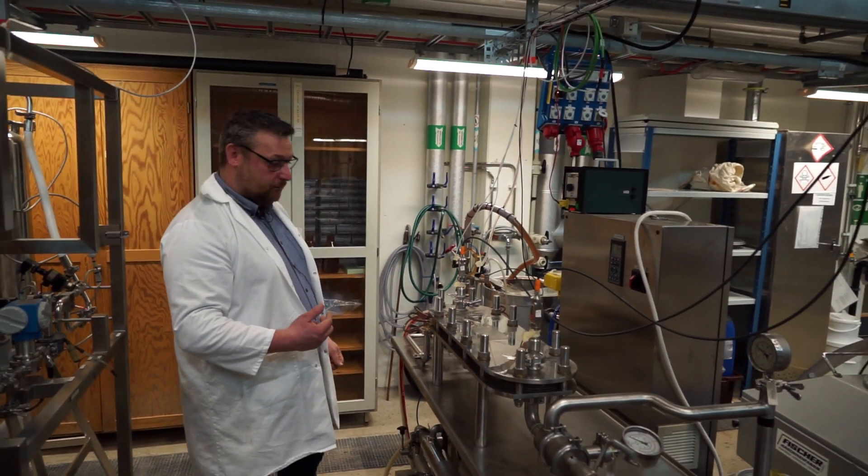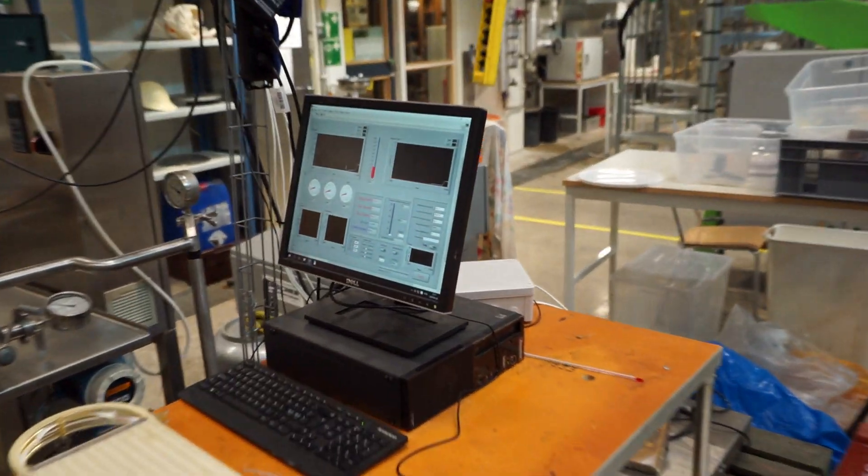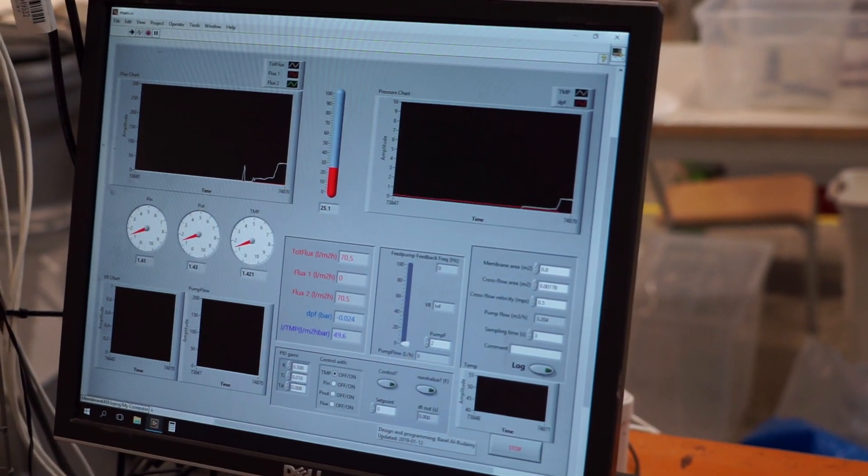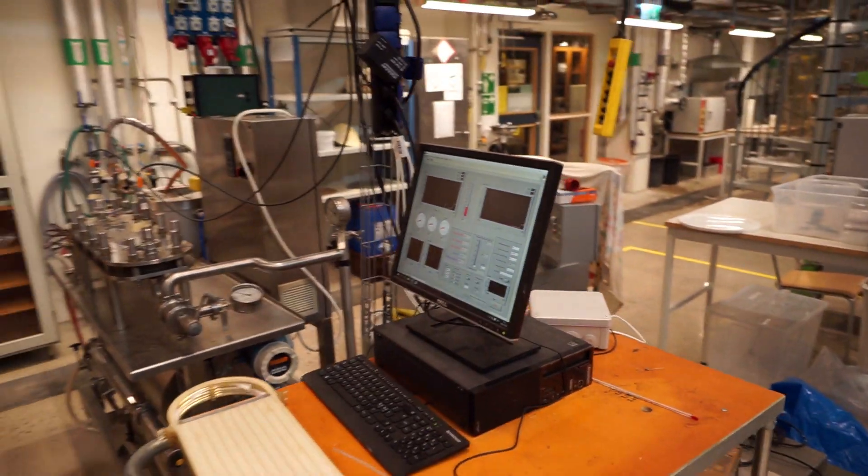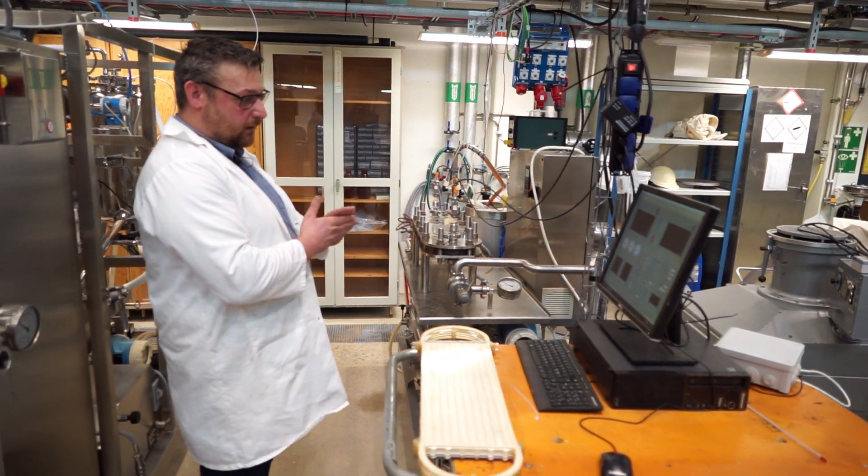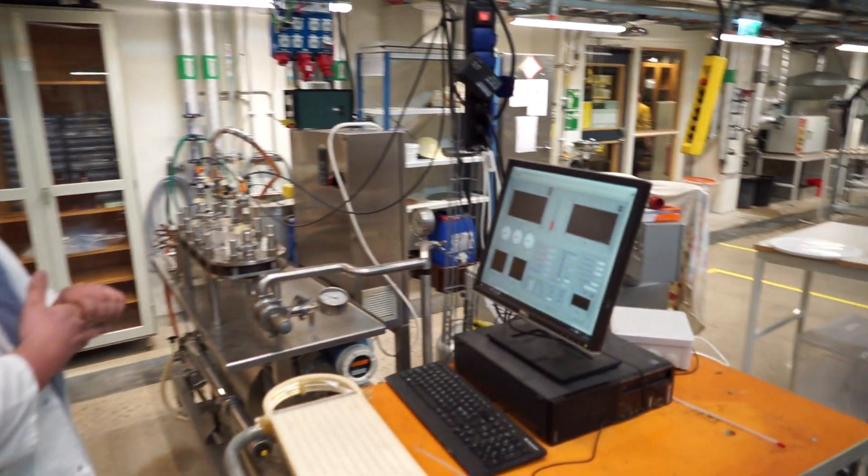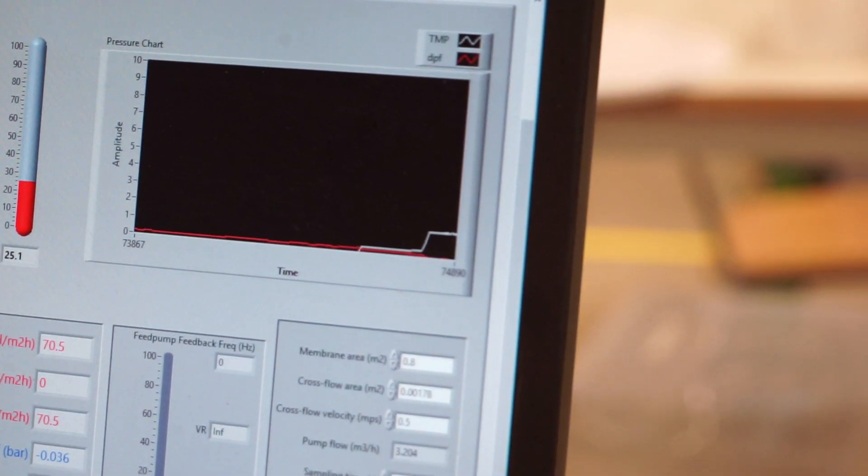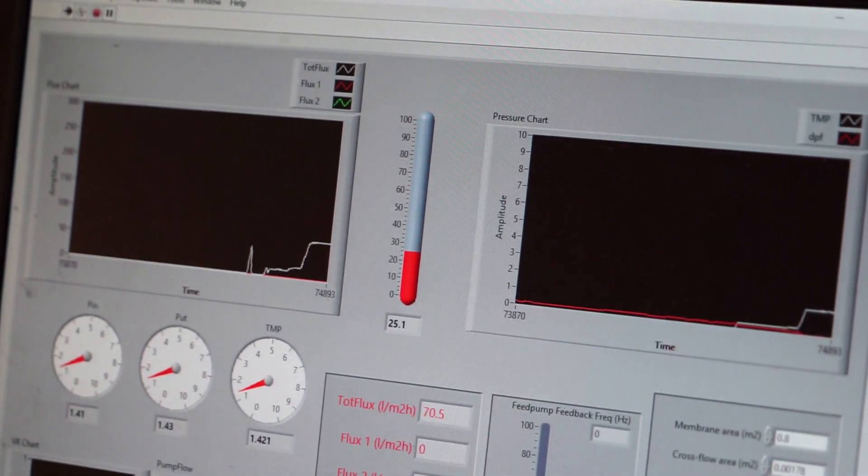There's a computer here as well. This is something that we use to record the data for the process. If you look at these graphs here, we can actually see when I started the process and when I started increasing the different things. There is a small jump there in the curve.